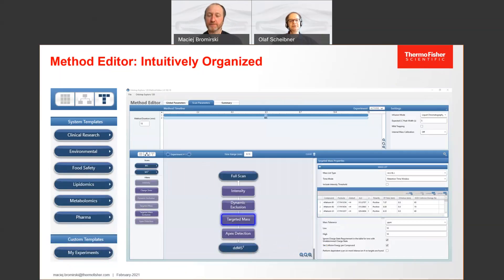The system comes with a newly developed method editor, which makes it easy to set up methods — not only because it's intuitive and graphically organized, but also because it provides predefined experiments that you can use as a starting point to develop your own experiments without starting from scratch. These methods are based on publications and application notes that you can refer to. You will find them immediately in the instrument control software. Even when new applications are issued, you can quickly download new method templates online, whenever you want, without any hassle or time lost.